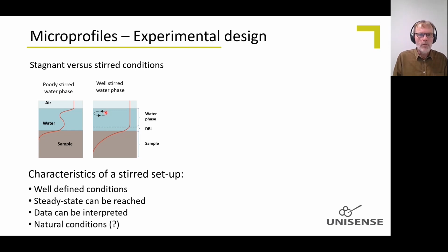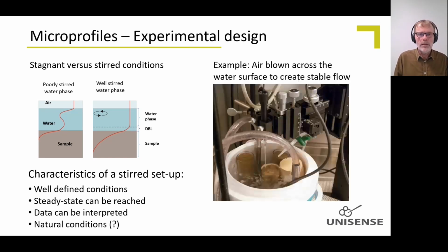If, on the other hand, you mix your water phase well and keep the oxygen constant up here, then you will have a constant concentration on the sediment surface and you will have a steady state profile over time. So it means it will not change over time. This is important for doing all the calculations that I just mentioned.